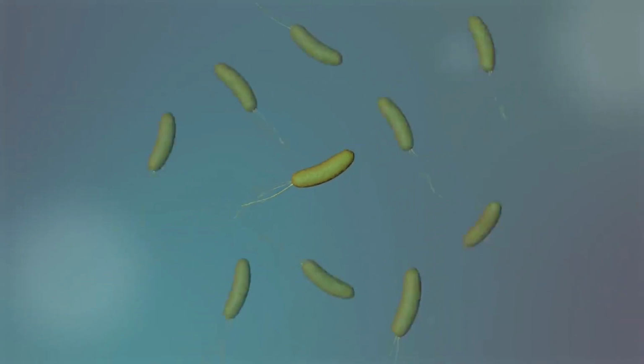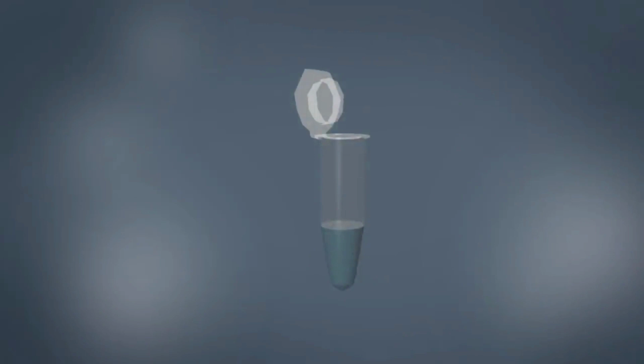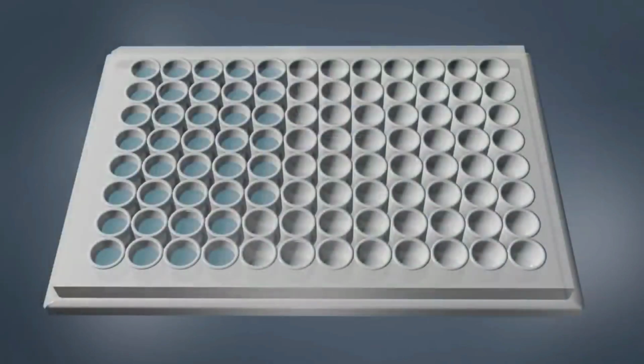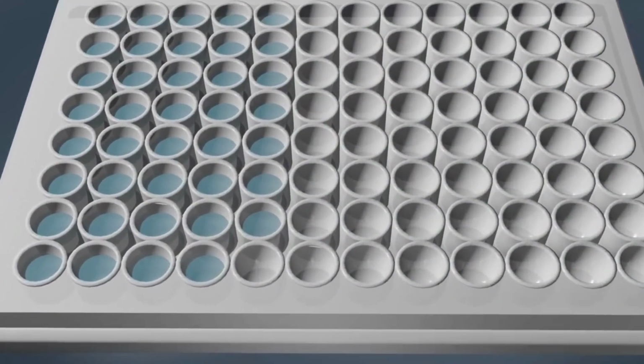This makes it possible to produce lots and lots of copies of it as the bacterial cells multiply. The DNA is then isolated from the bacteria and sent for sequencing. The isolated DNA is transferred to a plate where the sequencing reaction will take place.